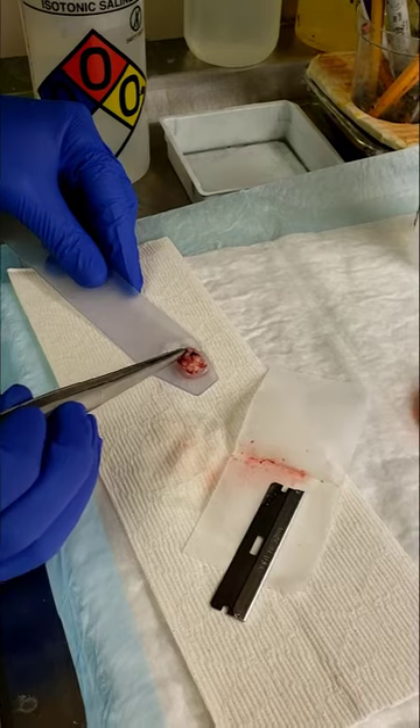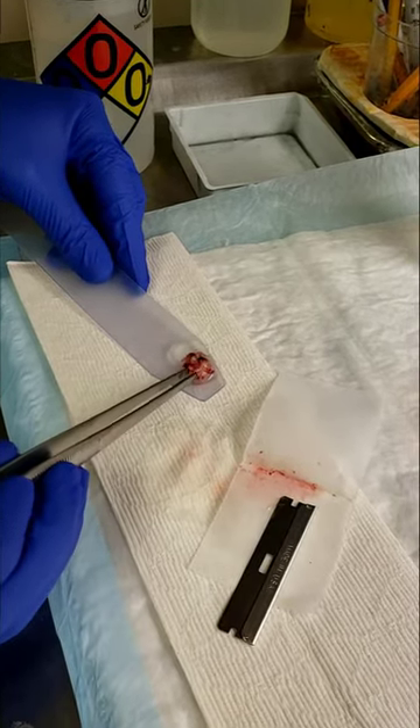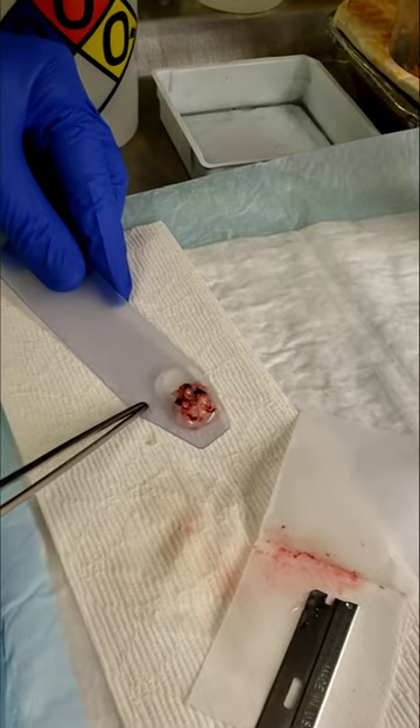Hi everyone. So here we are at the frozen section bench. This is a little bit of tumor. It comes in as a glottic mass. And the first step that we do is we look at it and document what it looks like.